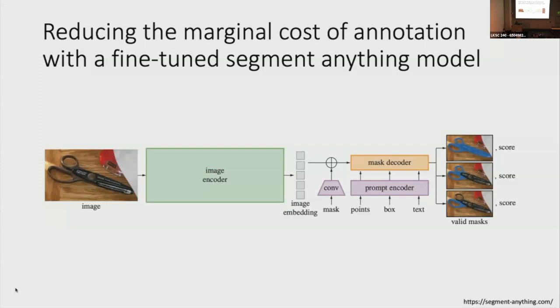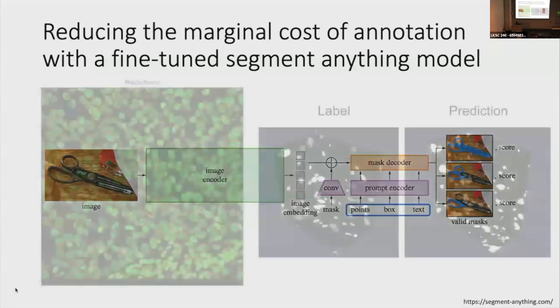The problem with this method is that, one, there are differences with the cellular and tissue imaging data that prevent it from working well, and the training data is part of that. Second, these vision transformers can be very expensive to train. And the third is the way in which you ask these methods to generate masks for you. That's something that hasn't been well worked out for the nuances of these cellular imaging data.